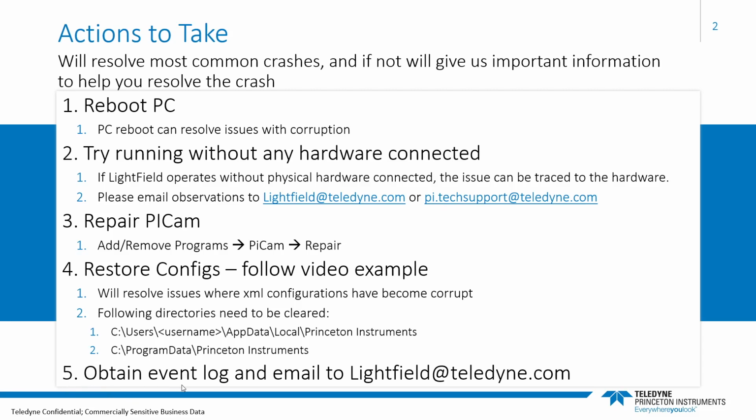Okay. And the last step, if none of this stuff works, we'll still be able to help you out. Just obtain an event log from the crash and email it to lightfield@teledyne.com. That way, we get it and we can get back to you with an idea of where the problem might be coming from. So how to get this event log, we're going to go through it right now.